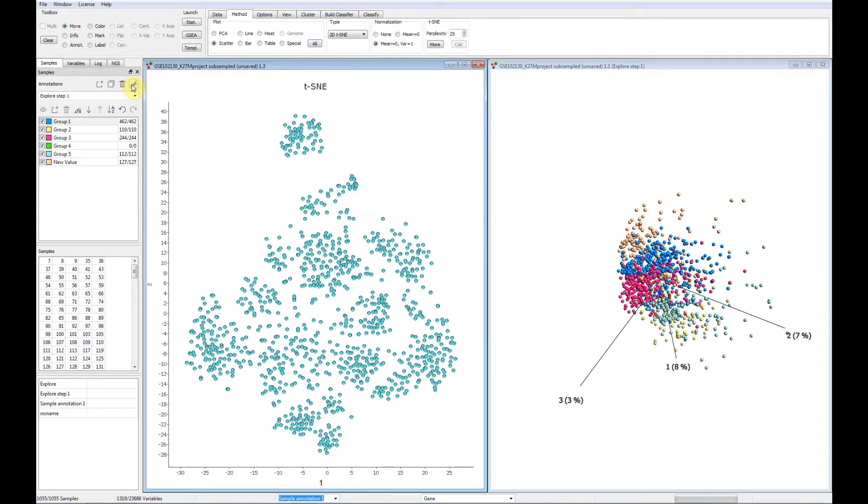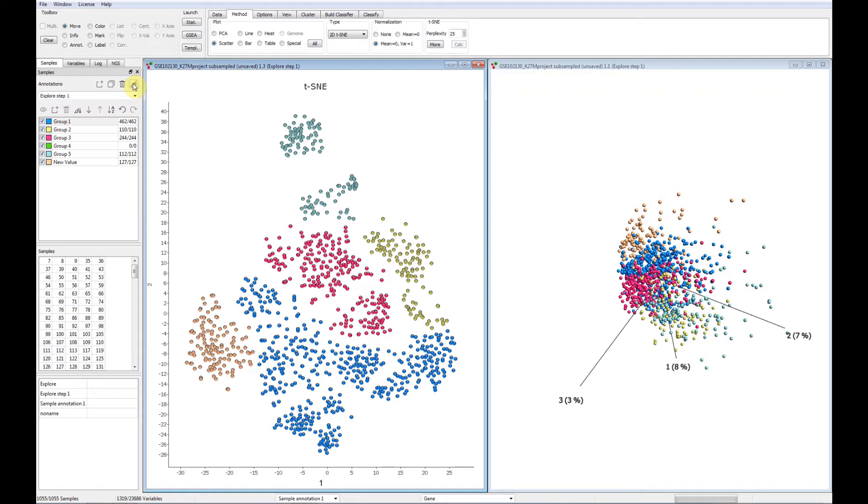We now color the plot in the same way as the PCA plot. All functionality, including statistical filters, can be applied and the results can be visualized in the T-SNE plot. Going back and forth between these plots does not require any changes in settings and is always super fast.